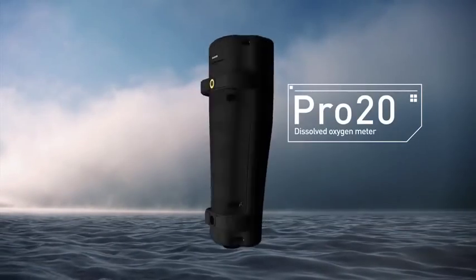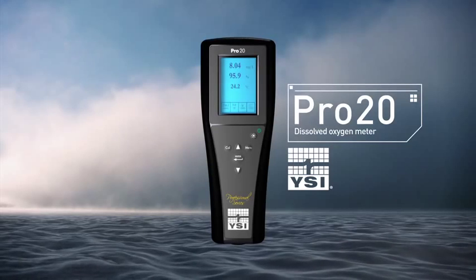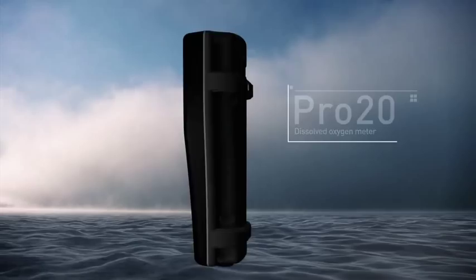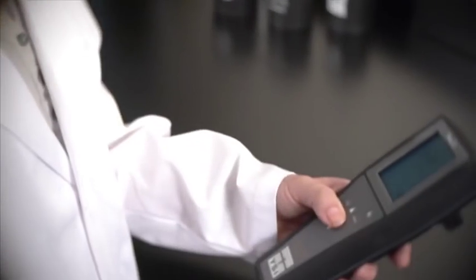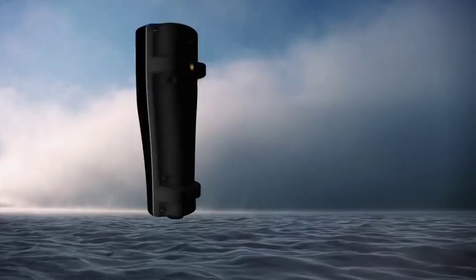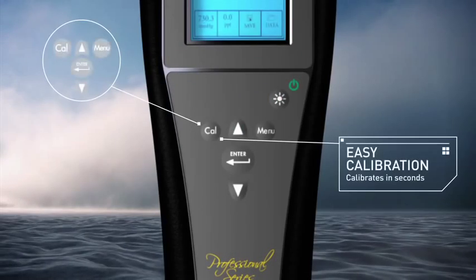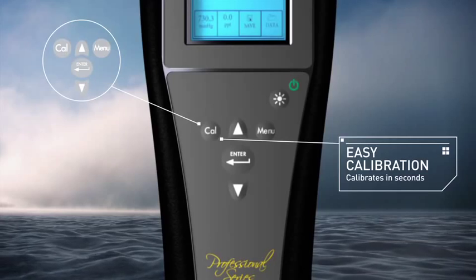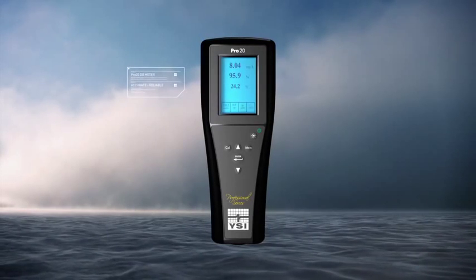Here's the Pro 20 Dissolved Oxygen Meter from YSI — everything you need in a handheld DO meter. The YSI Pro 20 is the ideal instrument for its ruggedness, simplicity, and reliability, and it can go from the lab to the field in seconds. User-replaceable sensors and cables, along with a convenient one-touch CAL feature and guided setup, make it extremely user-friendly. Here's why the Pro 20 is the only DO meter you'll need for your application.